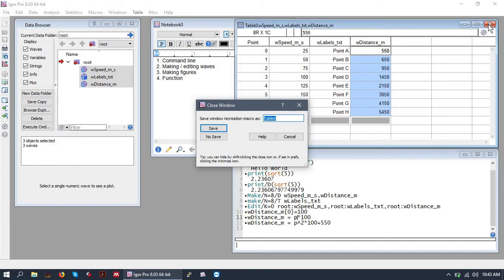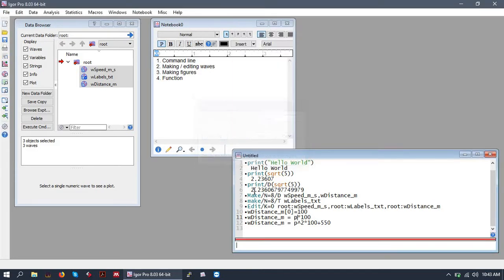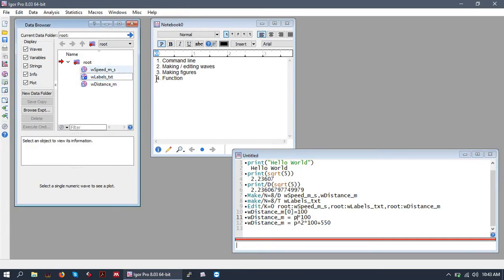Alright so that's basically how you can make and edit waves very simply. Let's close our table and when we close our table it asks us if we would like to save it.